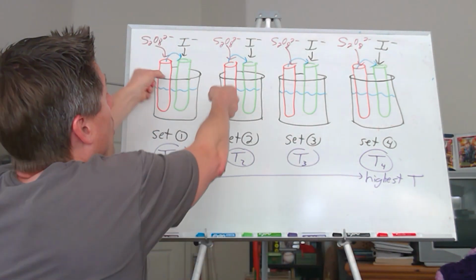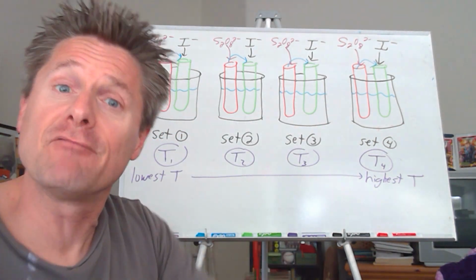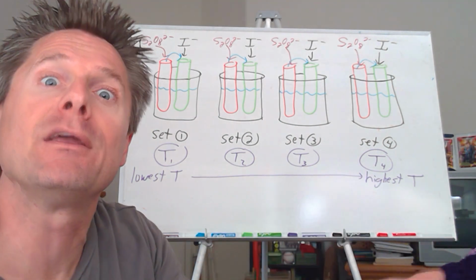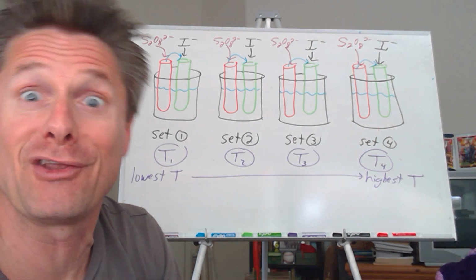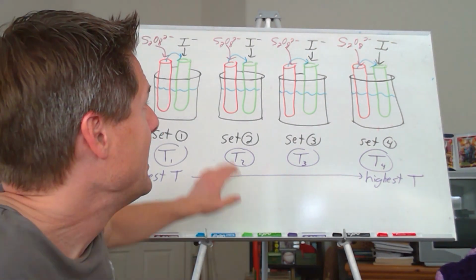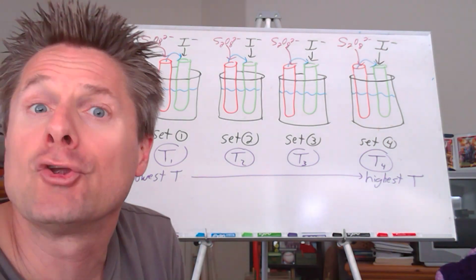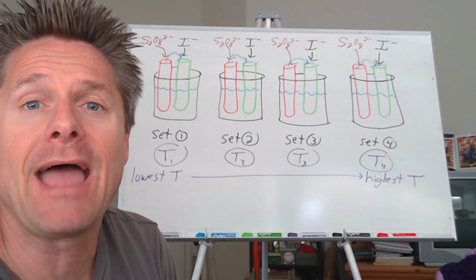And then when I pour these 2 test tubes together, that process of mixing the 2 solutions dilutes it again. So you have to do the M1V1 equals M2V2 a second time for each one of these. At least it's only 4 instead of 6 like it was in the kinetics lab. And then you can calculate your concentration changes. You'll be able to calculate your rates. You'll be able to calculate your rate constants and then make that graph.